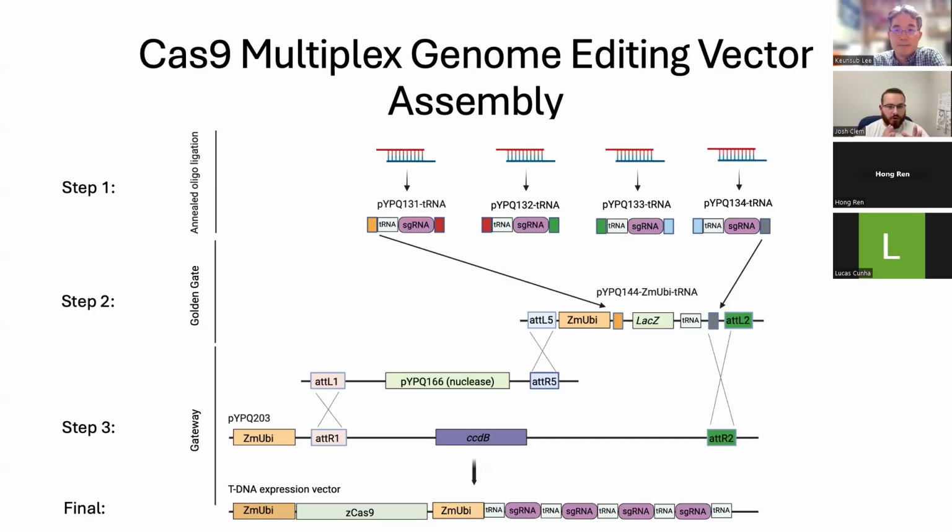However, off-targeting can be very challenging to avoid. I wouldn't want to design a guide RNA that has a perfect match to an off-target sequence within the genome. I will tolerate some mismatches because those get very difficult to avoid. And also when you start to include mismatches in your guide RNA, the efficiency tends to go down a lot.